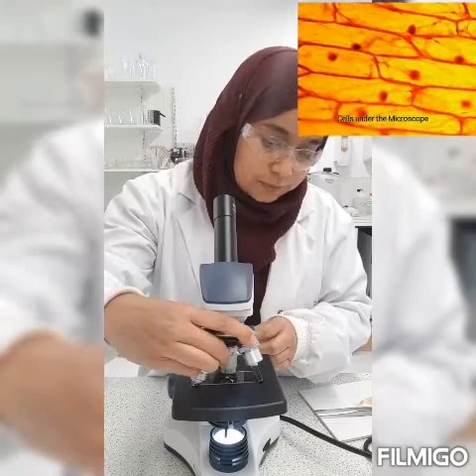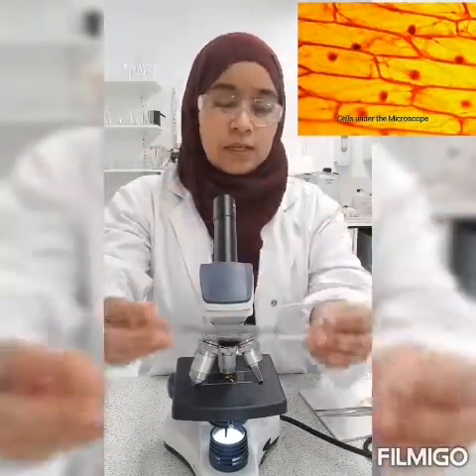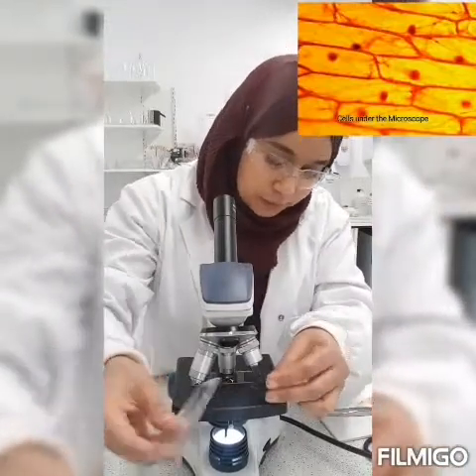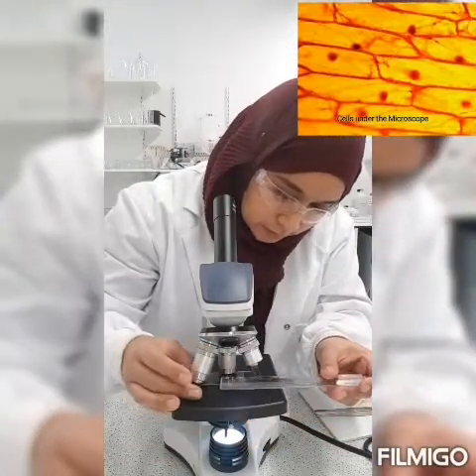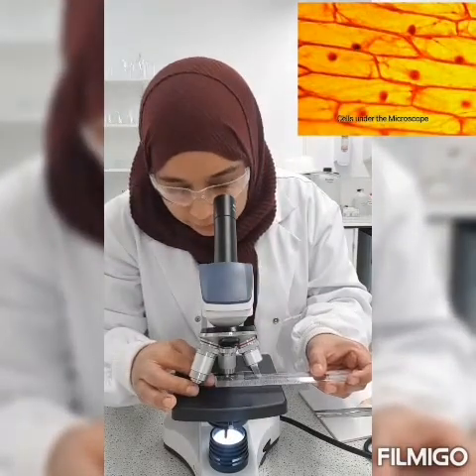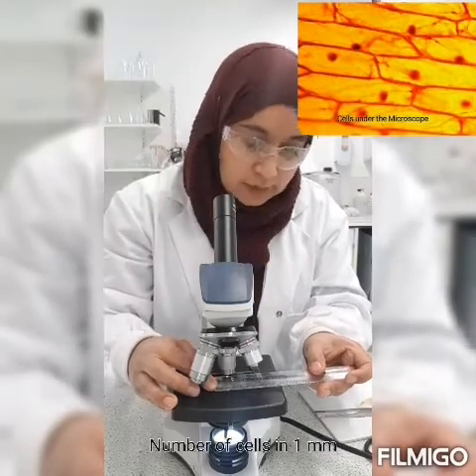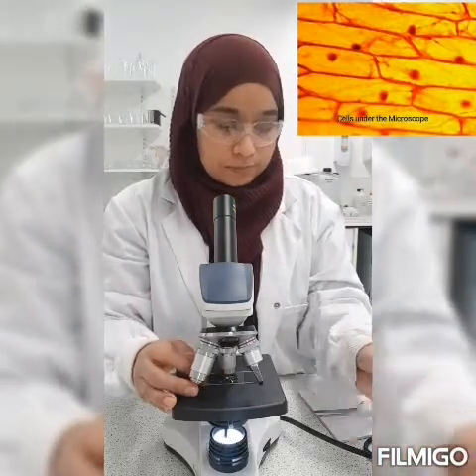Now what you would do is use a ruler, make sure it's a clear one, and you will put it under the microscope and measure the cells. So what you will do is 1 millimeter, and you will see how many cells fall in that 1 millimeter, and that's what you will record.